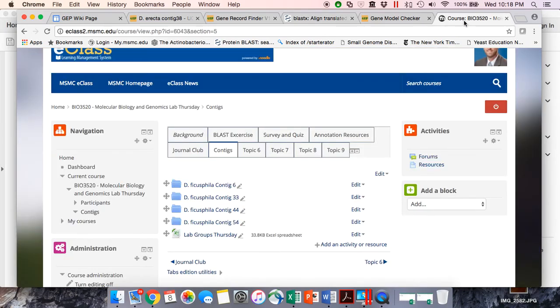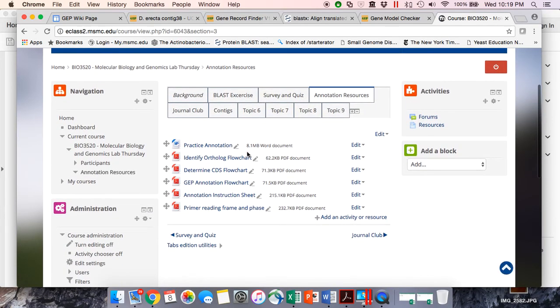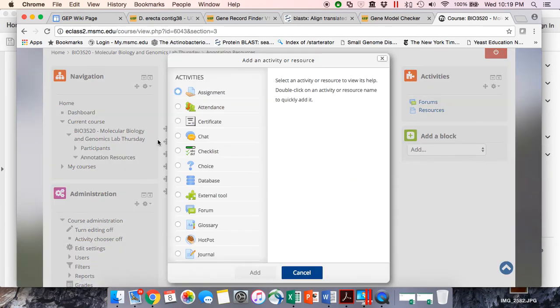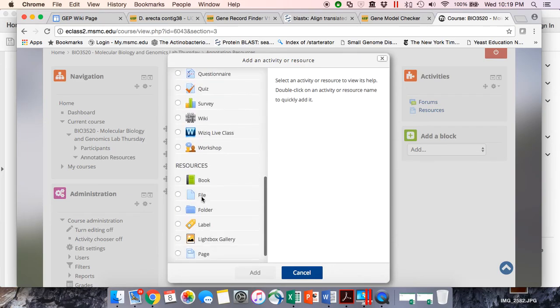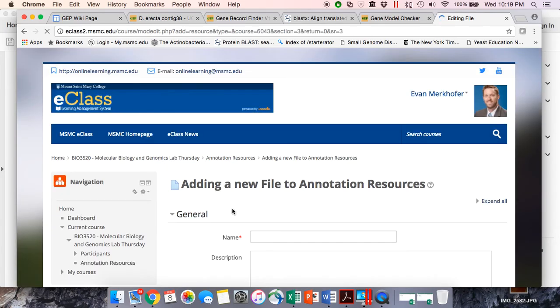So if you don't know where that is on your computer, you can go to Annotation Resources, and I am actually going to upload it right now. Apologize, I thought it was on there. So I'm going to upload the sequence.